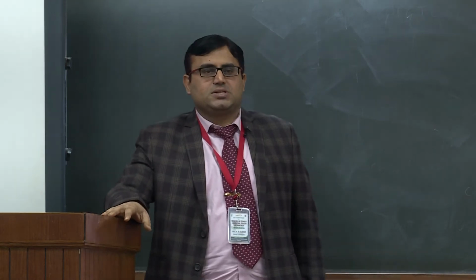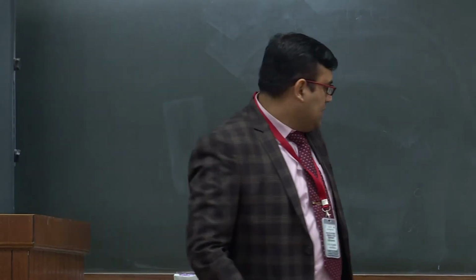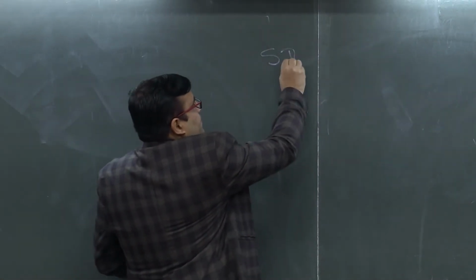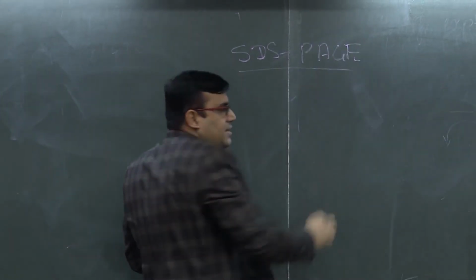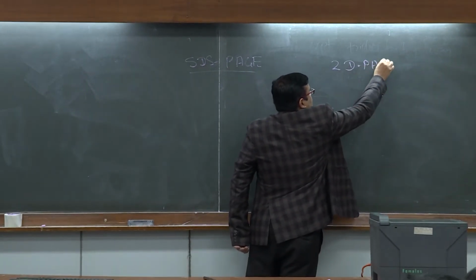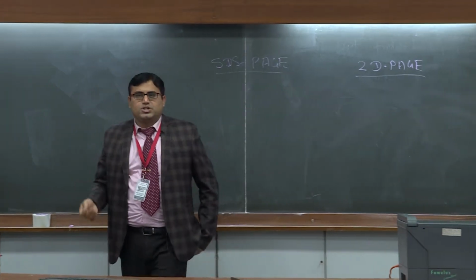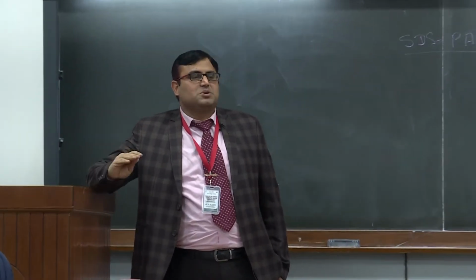This experiment session, today we are going to have two experiments simultaneously. One is your SDS Page, and the other experiment is two-dimensional polyacrylamide gel electrophoresis. Before going on to the workflow chart of these two particular experiments, I think you should know the basic differences between these two.